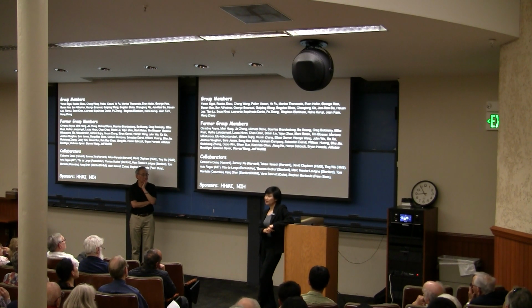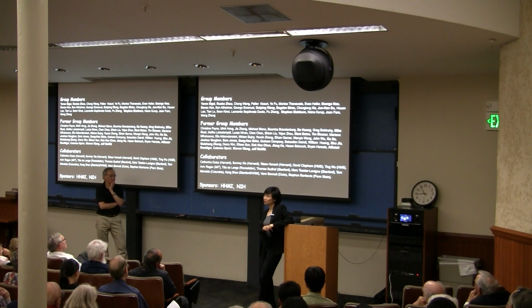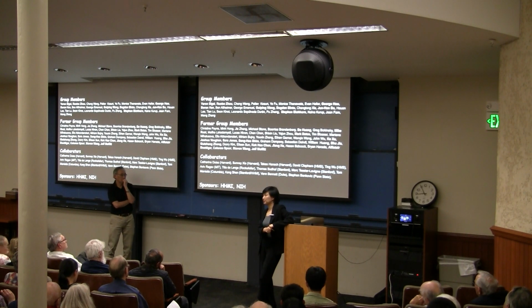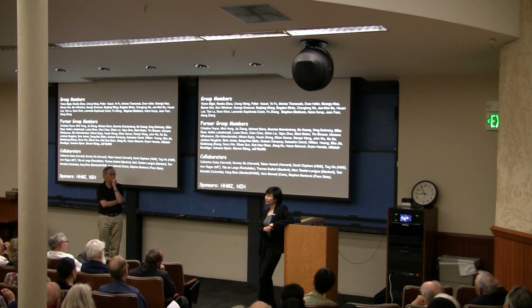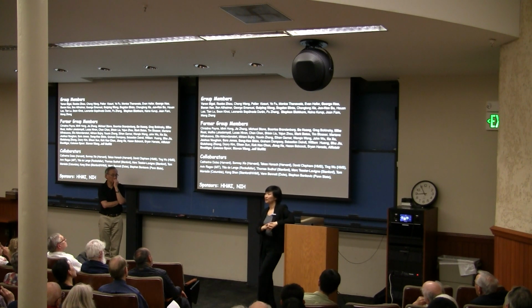Now, the second thing is, as you go deeper and deeper into the tissue, STORM or typical sensitive imaging approaches that rely on the detection of single molecules run into trouble with signal-to-background ratio, because we need the single molecule signal to stand above the fluorescence background. If you go very deep, the background gets accumulated pretty strongly. And there you can use an optical sectioning approach. For example, the light sheet, I don't know whether you have heard of that. You're sending light that looks like a thin sheet, and then with that you can actually remove the out-of-focus background. So that's one way to overcome that.